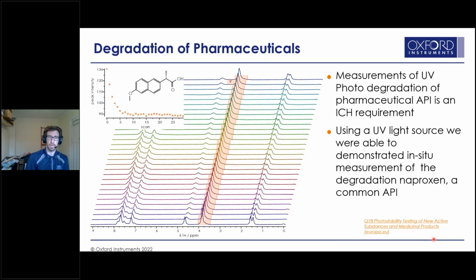And finally, using that UV light head. One of the beautiful things about benchtop NMR is that effectively all this light and all the electronics associated with the illumination and the cooling for any of these LEDs that do get a little warmer, like when you're using a high-powered UV, are all external to the instrument. So there's no effect on the spectrum at all, other than that induced by the illumination.